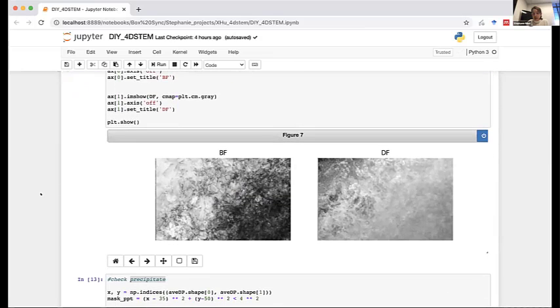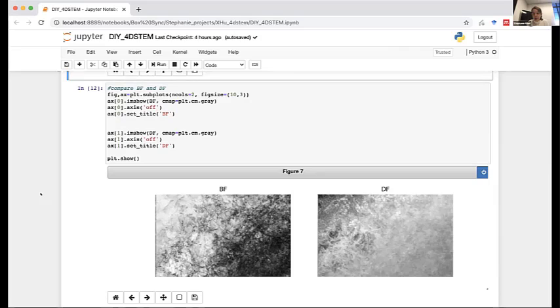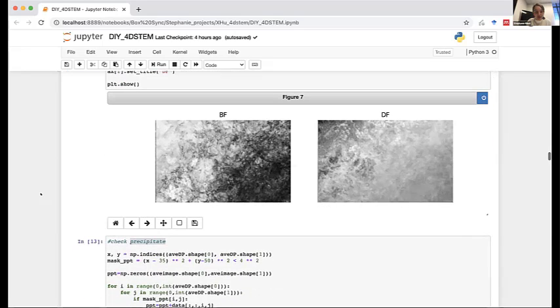So now we're going to do the same thing again, but we're going to do it slightly differently. We want to get a little bit more information about the sample, and we're going to use detectors. We're going to do a special type of dark field where our detectors are tuned specifically to our sample. Again, this is much like what Anna showed to do in digital micrograph. So we're going to look for precipitates in the sample.